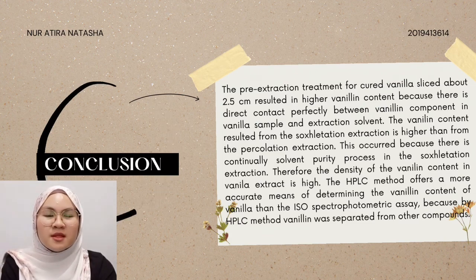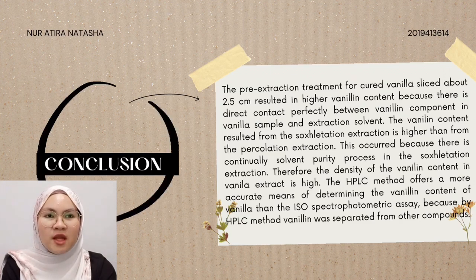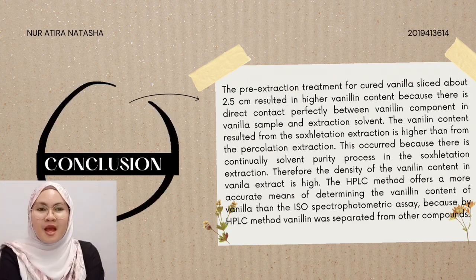The HPLC method offers a more accurate means of determining the vanillin content of vanilla than the spectrophotometric assay, because by the HPLC method, vanillin was separated from other compounds.